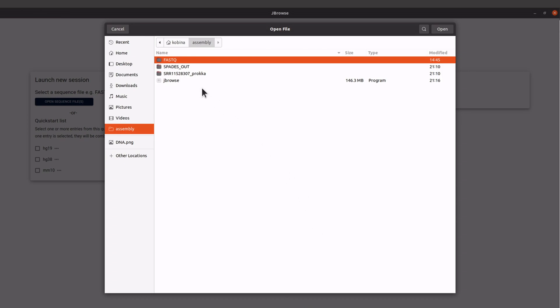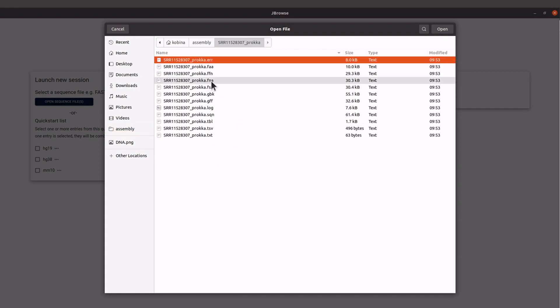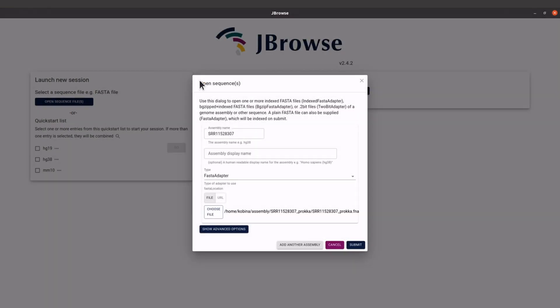The file I want to open is in the annotation directory. The directory was generated by Prokka, so click it and open it, then search for the dot FNA file. You can click and open or double-click — either should be fine.